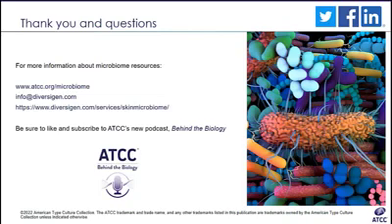All right. So, are there batch effects created by mixing skin sample types, like dry and oily sites with different copy numbers? Is the normalization going to cause issues at batch? Yeah, that's a great question. There shouldn't be batch effects if you're processing your samples when you're preparing the library. Usually you see batch effects when you have processed and analyzed your samples at different times, sometimes with different technicians, but if it's the same technician who prepared the samples for library prep the same day using the same techniques, there shouldn't be a batch effect. Okay.